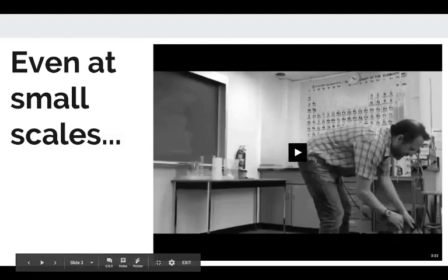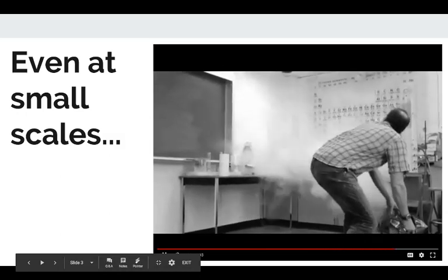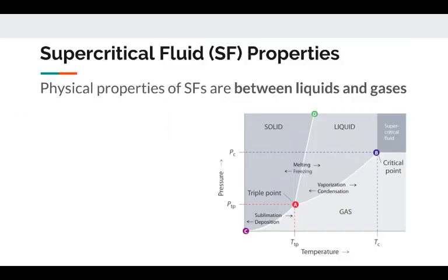In this video, a science teacher is conducting a demo of supercritical fluids in his classroom. So let's play it and see what happens. As you can see, it's a pretty big explosion, and I don't know if you noticed, but that dark spot right there is a hole in the ceiling that was produced from this explosion. So you can just imagine what would have happened to the teacher if he was in the wrong place at the wrong time.